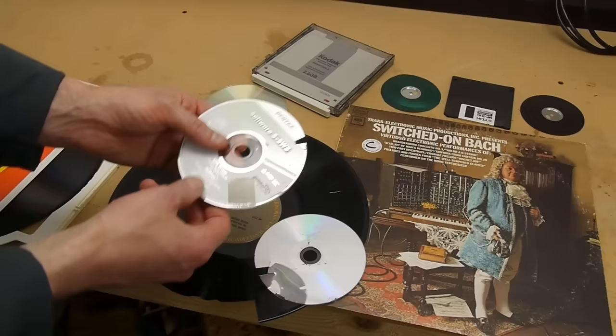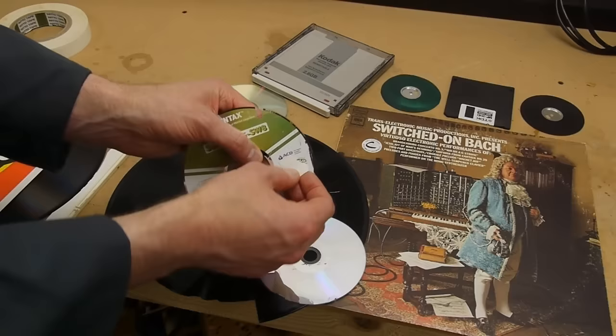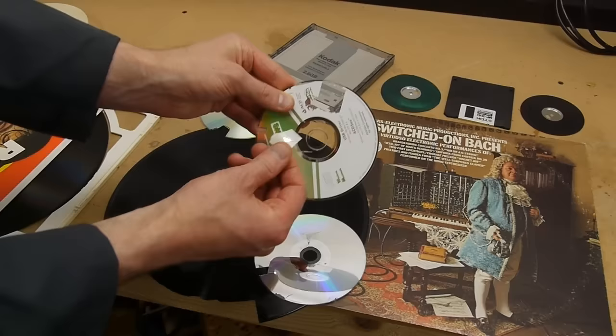I tried a bunch of other things, and then I found out the thing that works best is just double stick tape. Just get some really strong double stick tape and stick it down to the top of the disc and pull it off.